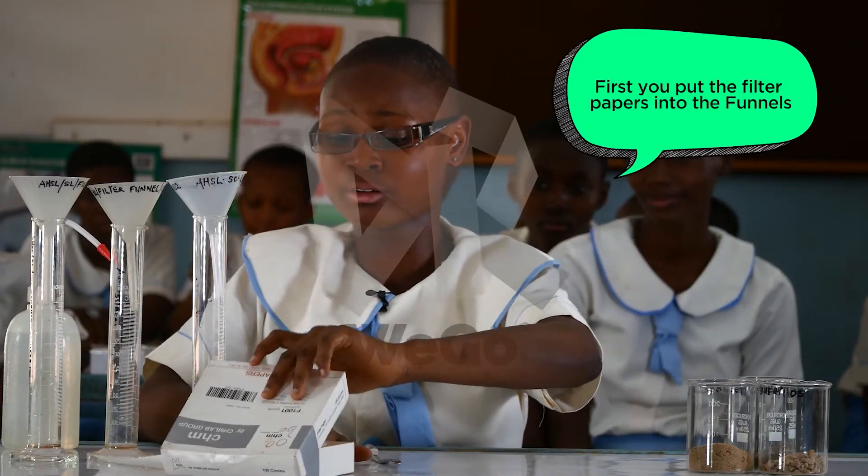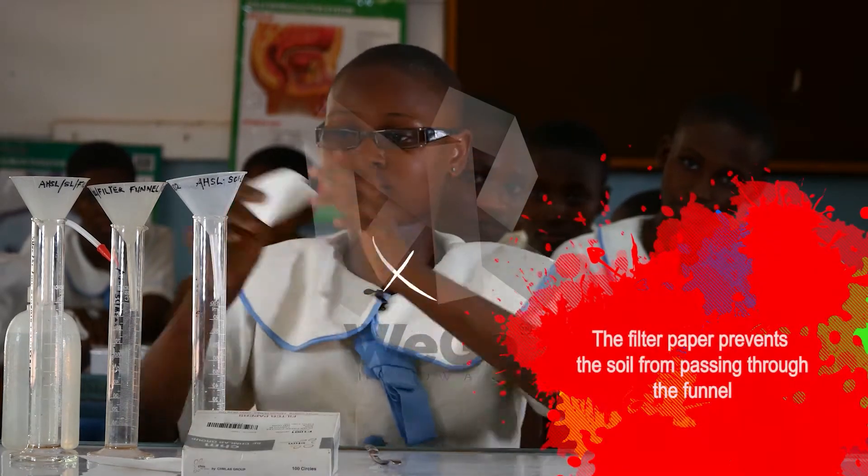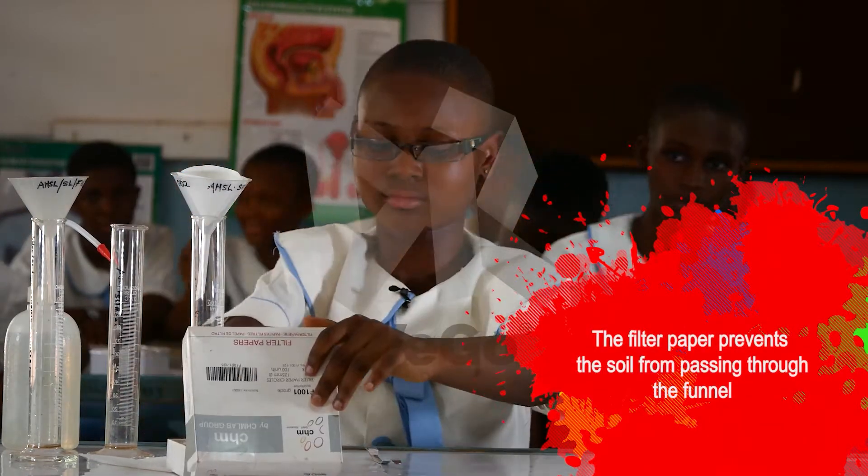First, we put the filter paper into the funnel. The filter paper prevents the soil from passing through the funnel.